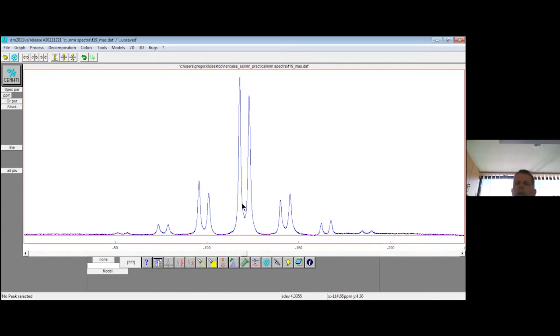And I was saying you have the isotropic parameter, which tells us where the shift will be, where the isotropic contribution will be. But then we have also two other parameters. They were denoted by delta and eta. And by fitting such a spectrum, which has a sufficient number of spinning sidebands, we can get this information as well.